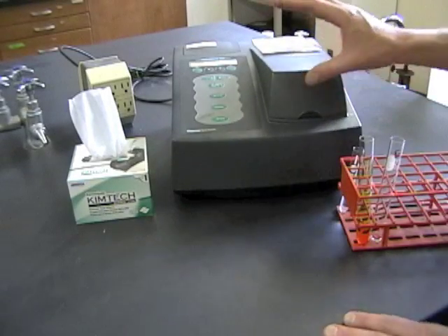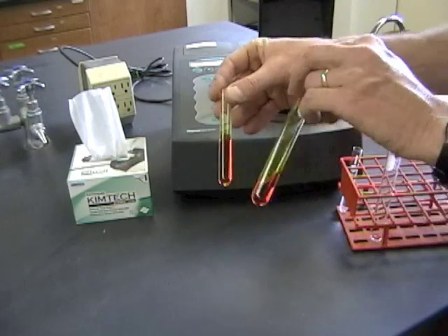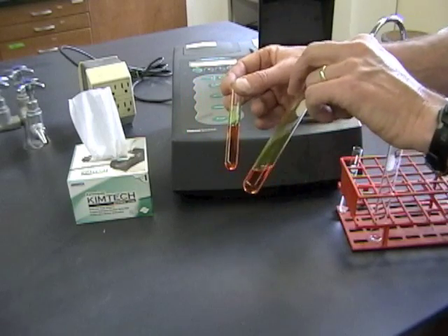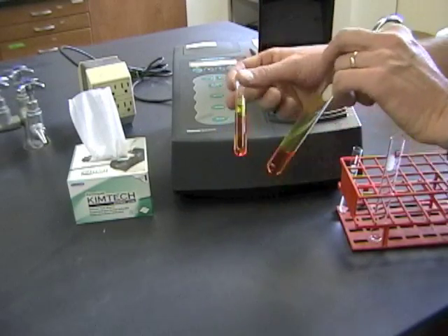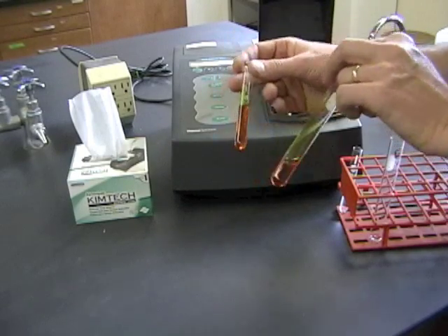It's 120 seconds later and this reaction is done. You can actually see that amber color in the spectrophotometer tube and also in the leftover mixture in your big tube. This is important to clean up quickly because this amber material will stain the tubes, so everything can get dumped down the sink.